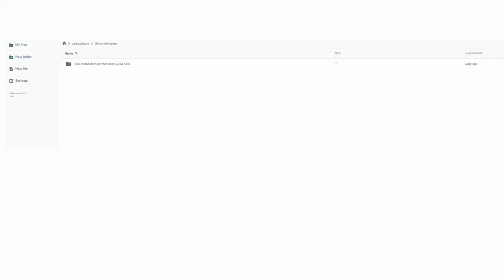Someone has already done it. Make sure that those of you who created an account with the tokens that we provided log in now. Great. Then you're all ready to upload your files.